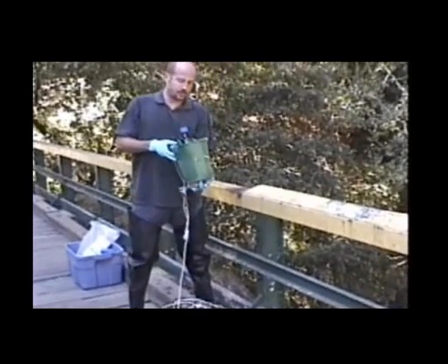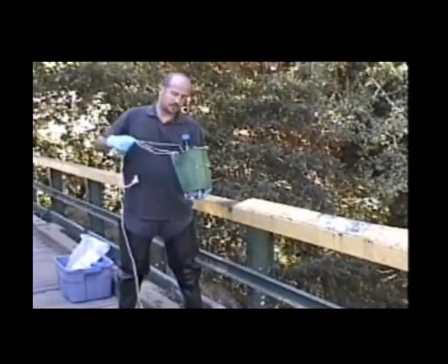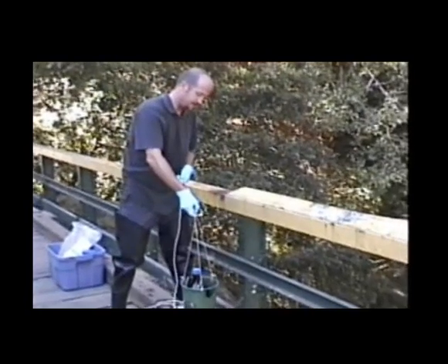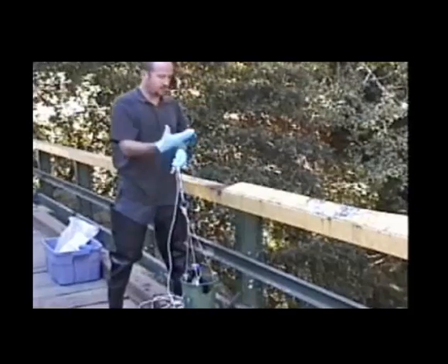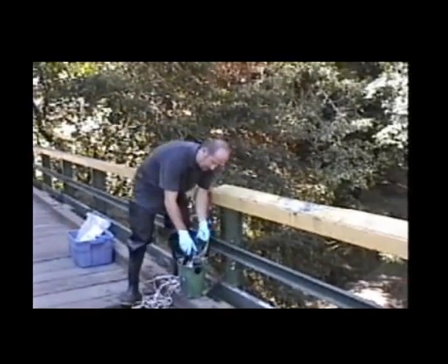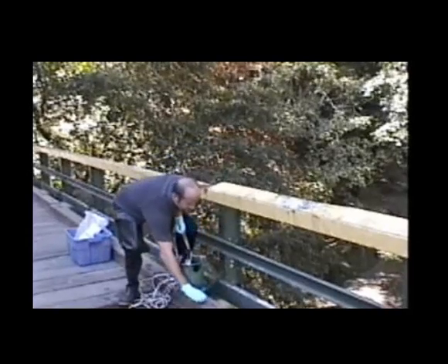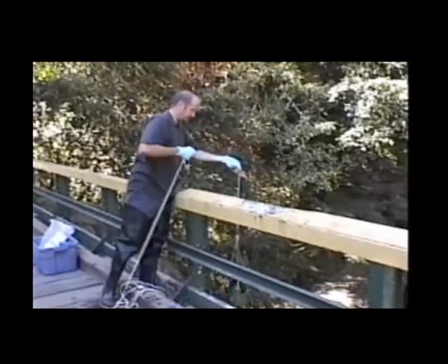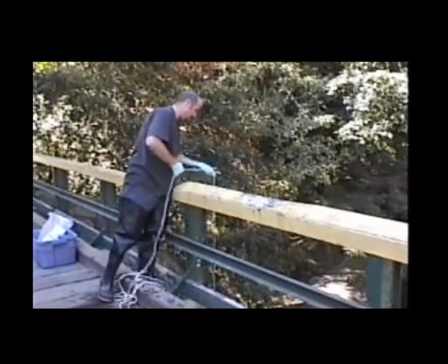One thing you want to note on this is that you are collecting a small amount of surface water in this sample because you're entering and exiting the water coming up through the surface. We'll take the cap off the bottle. Lower the bucket down. And just get enough water to where we can rinse the bottle.